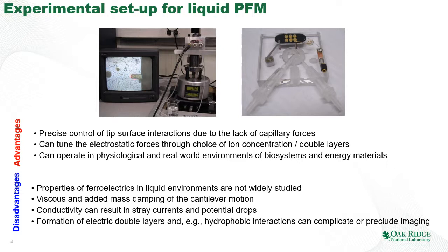But at that time, we were curious if PFM can work in liquid, and the assumption was that liquid allows us to control the tip-surface interactions precisely. We assumed that we can tune the electrostatic forces through the choice of the ion concentrations, and we can operate in environments which are relevant to biosystems and energy materials. Of course, there were disadvantages, because liquid environments are chemically active.